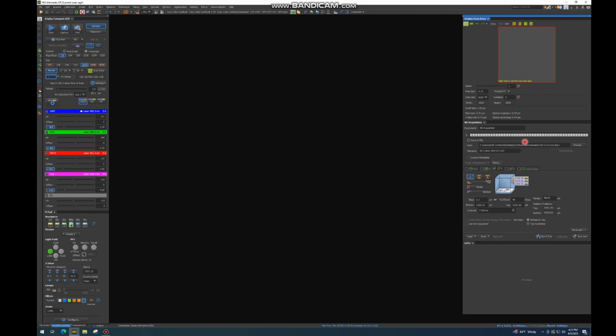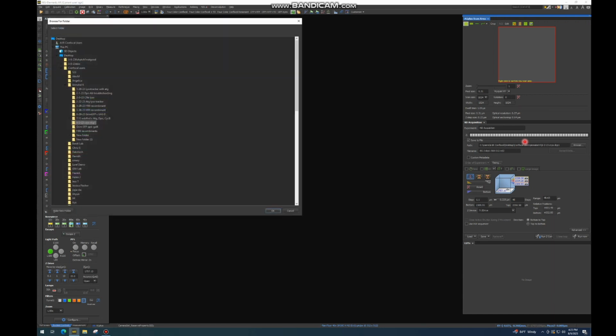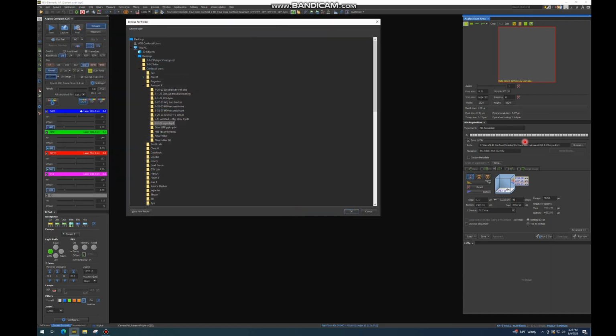You should regularly be offloading your images, and we will give 2 weeks notice before we delete anything. So here I'm just showing you how the folder looks, where we have everybody's names and then my folder and then the folders within my folder from the different imaging sessions.